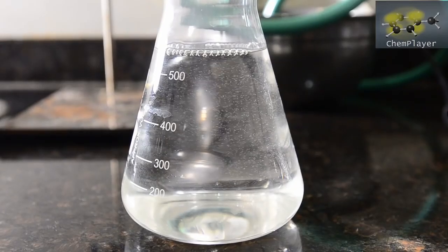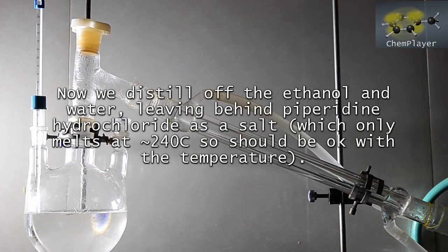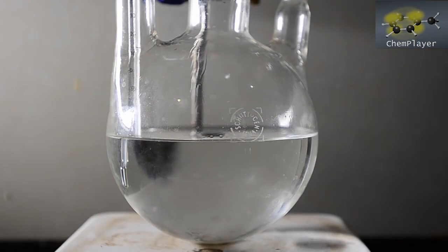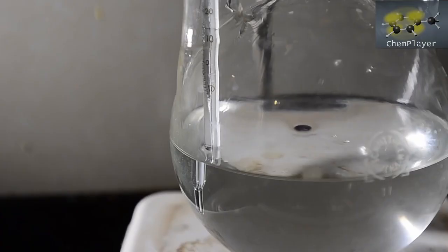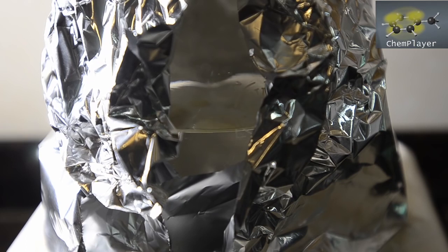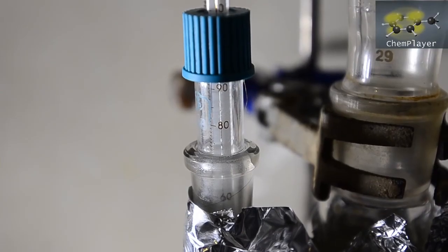And now it's time to distill again. This time to remove the ethanol and the water from our salt. This time we're using the nice big flask. And although the ethanol will be azeotropic, we'll get the fraction boiling at about 80 degrees C and save it. Just below 80 now and boiling.